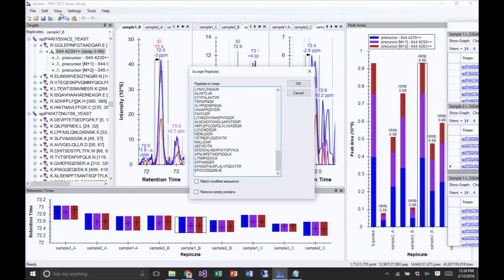You have to go to View, Group Comparison. You have to open up all 3 group comparisons and then set their view to significant peptides, and you should get the same. So you should get one grid for each comparison that we're doing. Yeah, because you selected just simply 1 versus 2. Okay, I'm going to have to keep going now, and maybe I can help you afterwards.